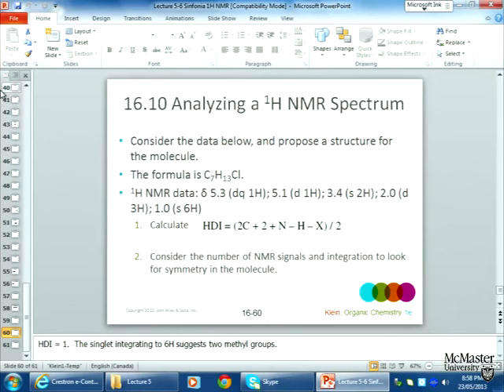Yeah. That's a good idea. Benzene would give you one signal with 6 hydrogens. But here we're not at the chemical shift of benzene. Anybody? Yeah. 2 identical methyl groups, right? That gives you 6 hydrogens. Yeah? 2 identical methylenes will give you 4, right? So you can have more than 3 neighbors. Okay, so we've got 2 identical methyl groups at 1 ppm.